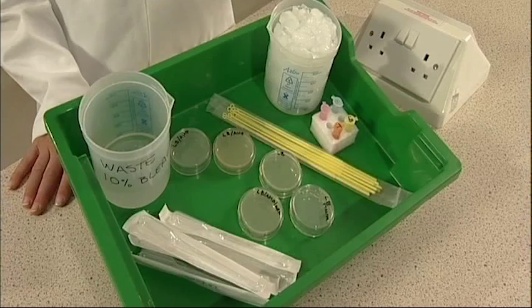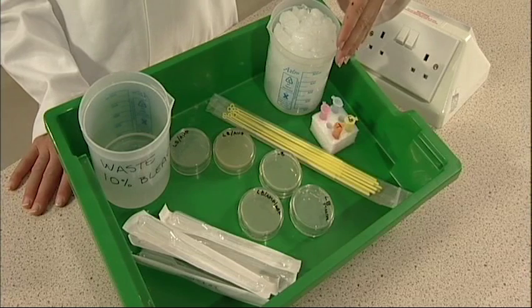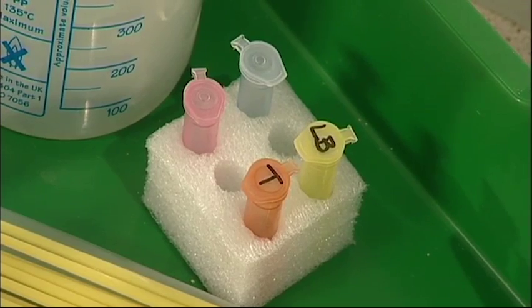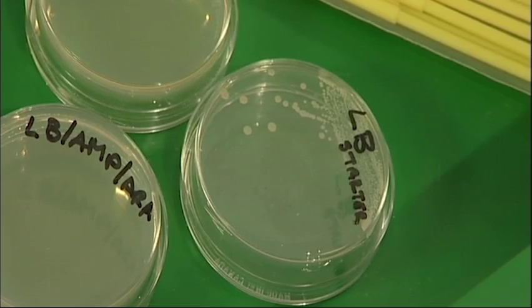Each workstation should contain a foam rack with an empty pink and blue tube with the lids closed, an orange tube labeled T with 1 ml of transformation solution, a yellow tube labeled LB with 1 ml of Luria-Bertani broth, and a starter plate with visible colonies growing on it.